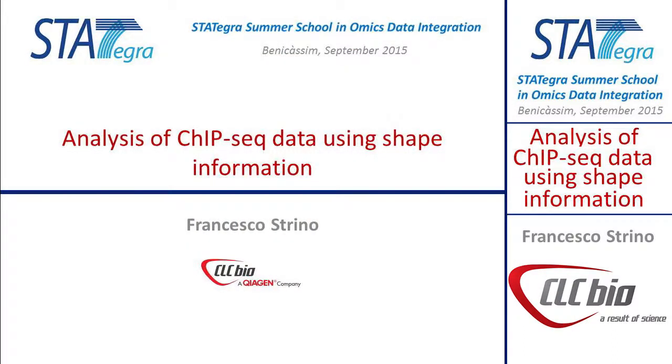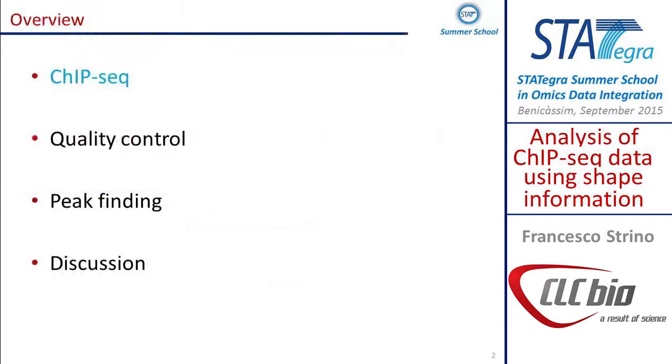Today I'm going to talk about ChIP-seq data. So I'll talk a little bit about what ChIP-seq is, and then I'll go on to quality control of ChIP-seq data. Then I'll talk a little bit about peak finding, and mostly how the algorithm that we developed works. And finally, there will be a short discussion.